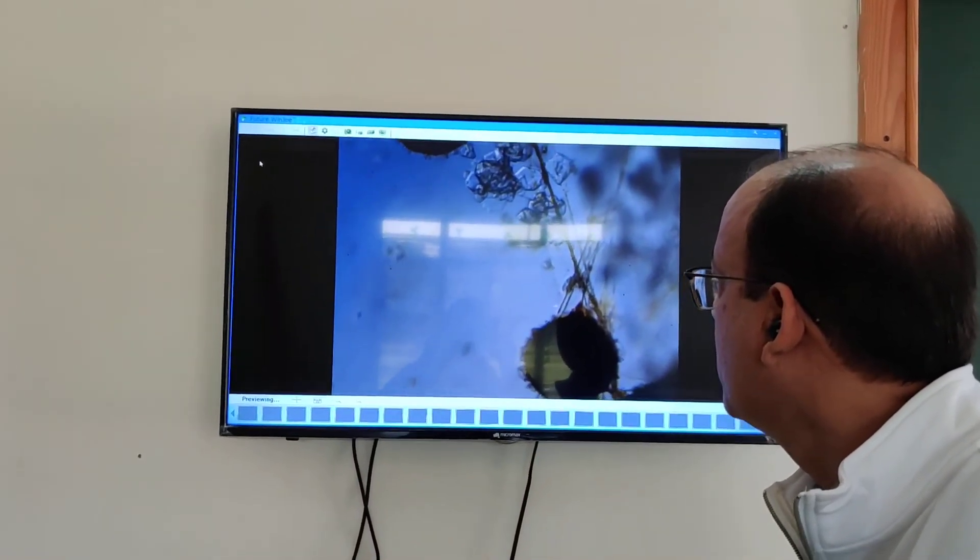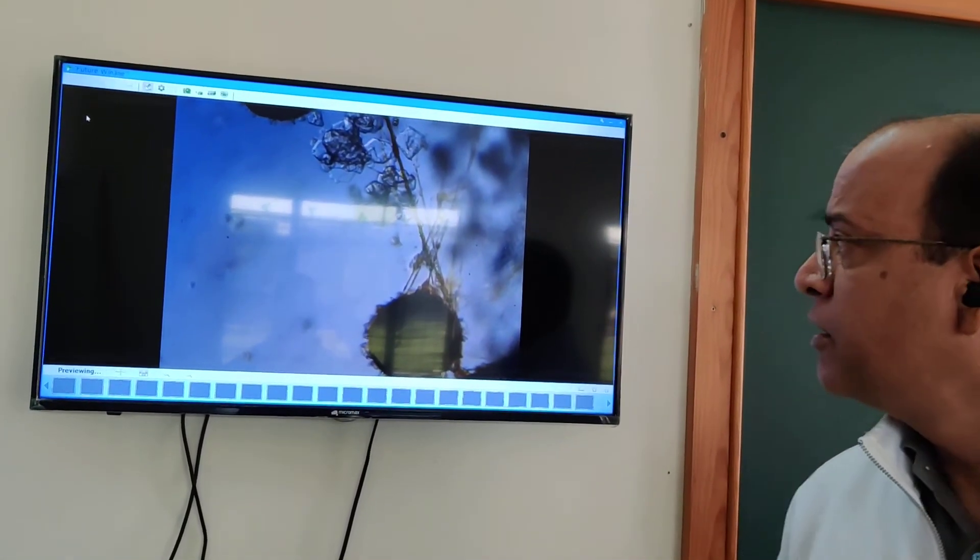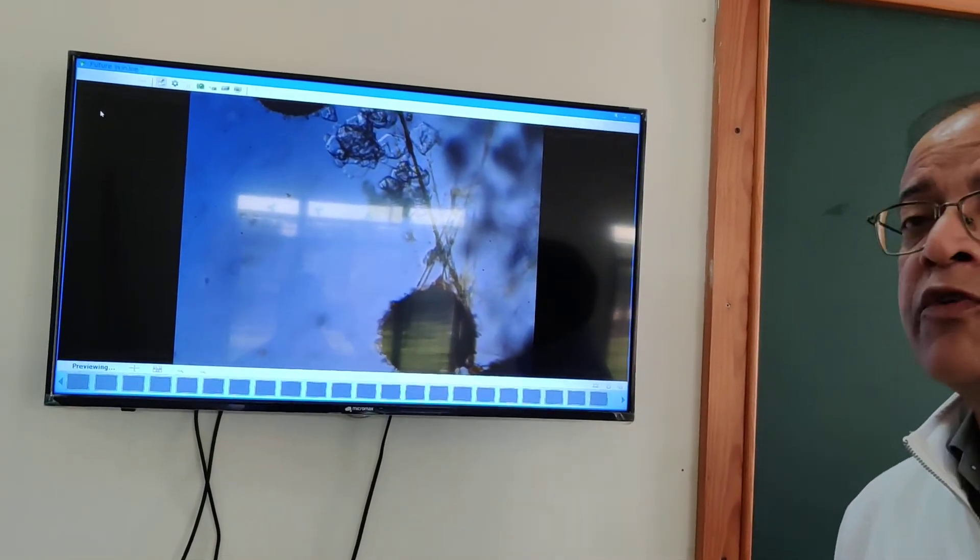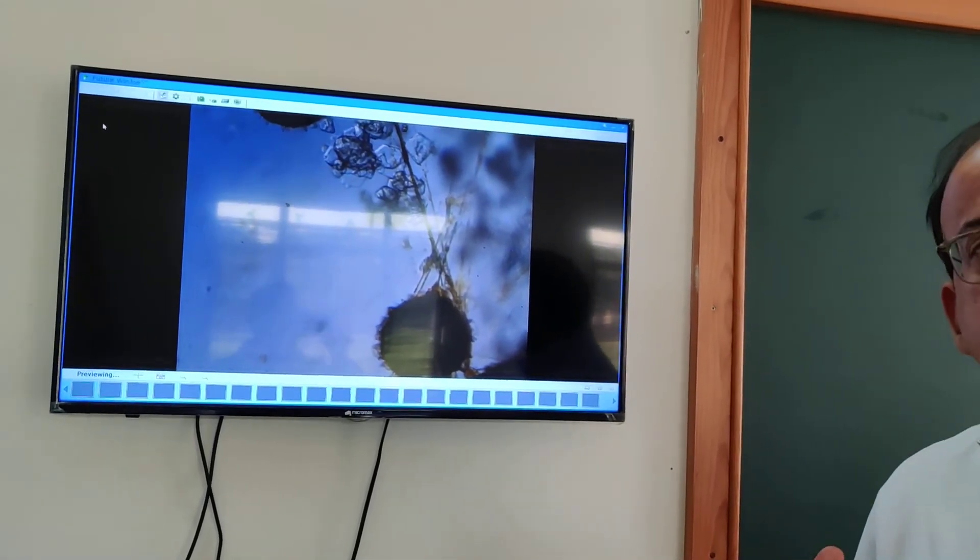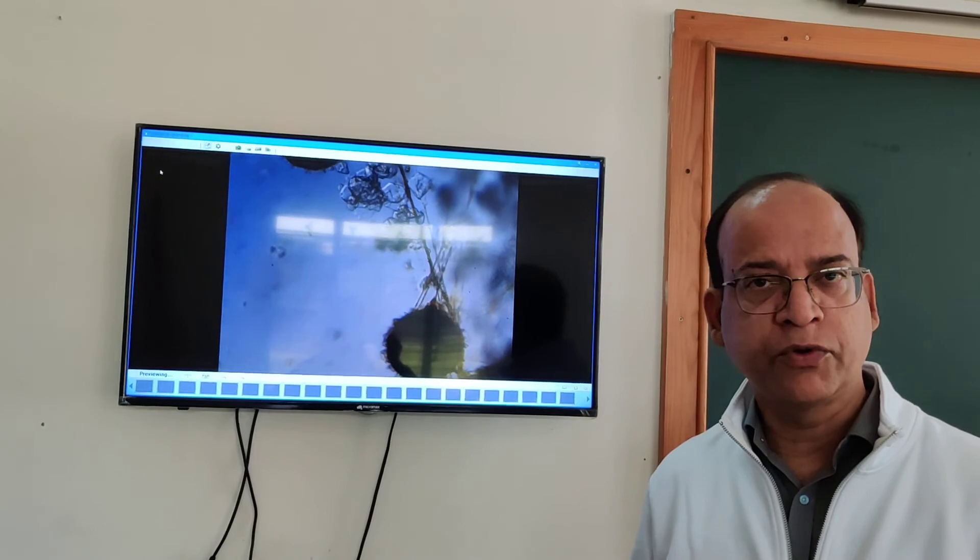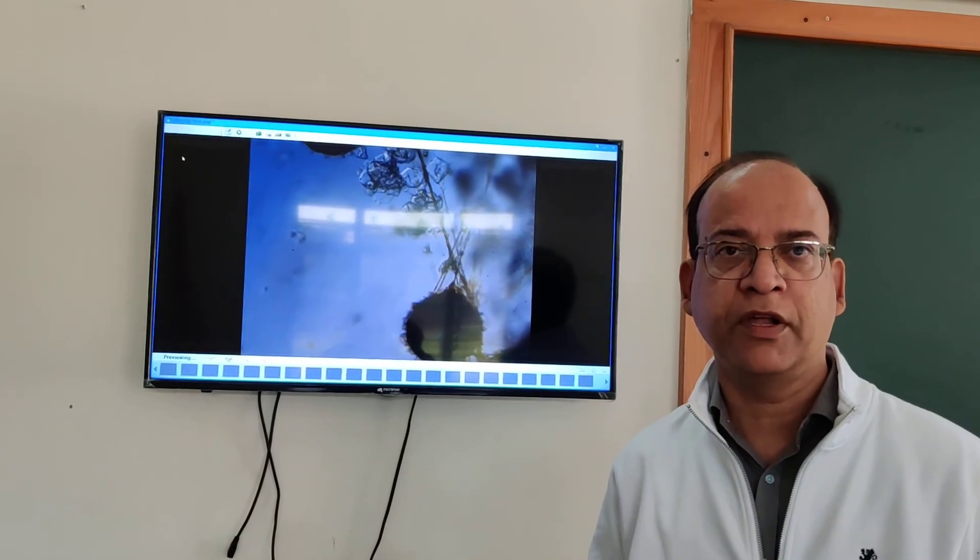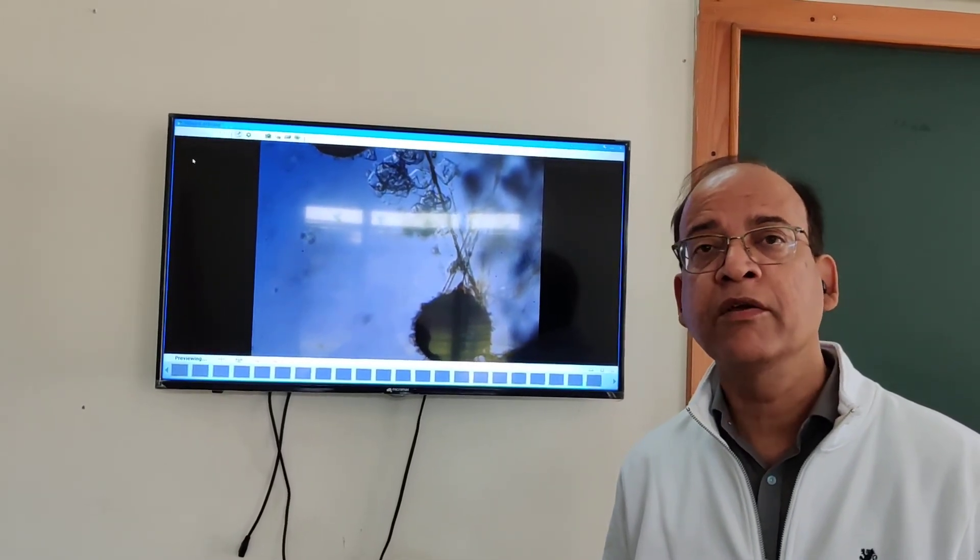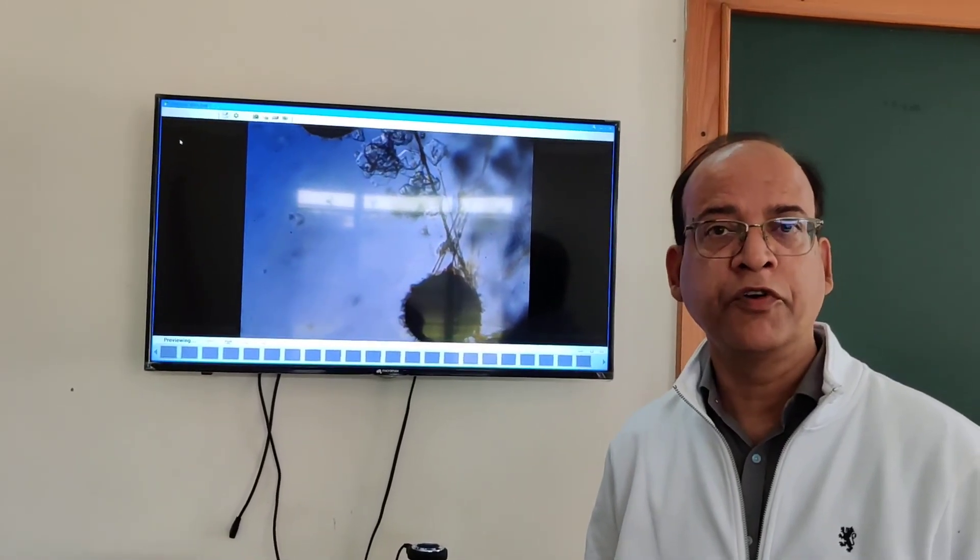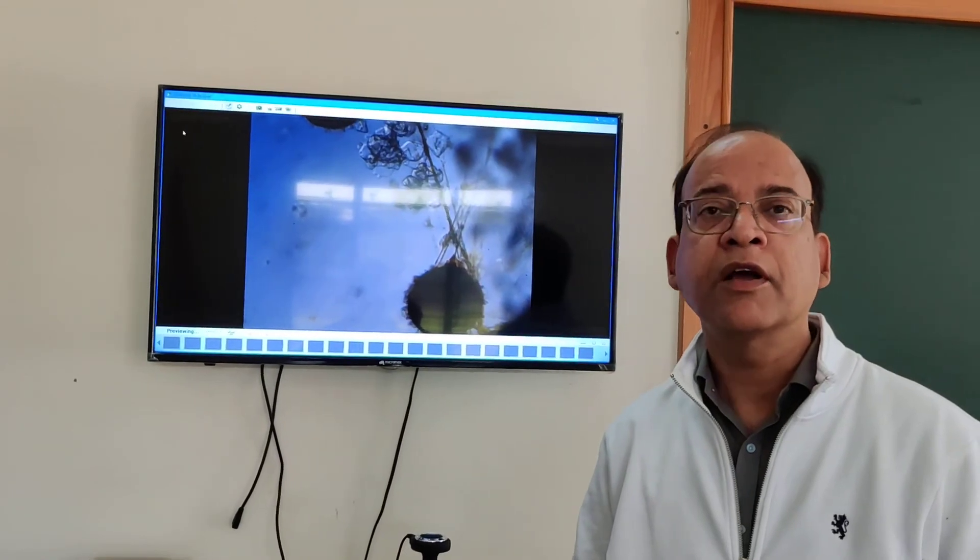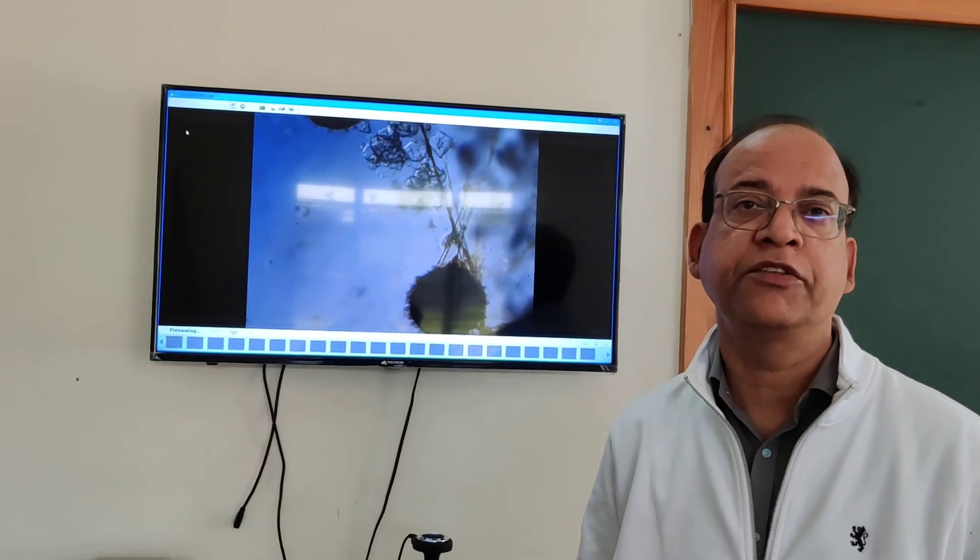We will repeat the process again after 5 minutes and count the number of pollen grains which are showing germination. We are continuously counting the number of pollen grains up to 30 minutes. Then we will repeat the process with other flowers also, and in the same way we will study the rate of germination of pollen grain. After that we can compare the rate of germination of pollen grain in different species of plants.